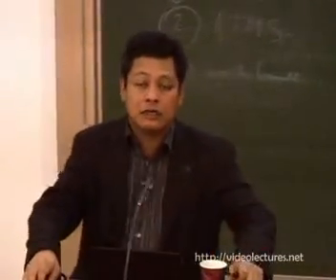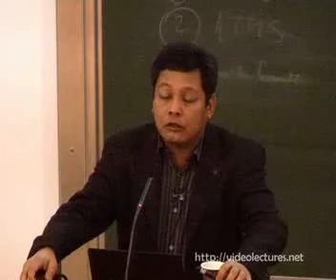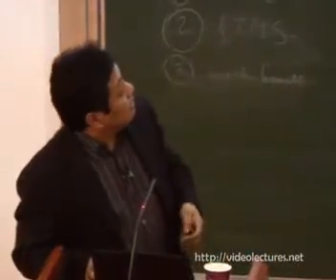Today my talk concerns how we study matter at the atomic level and the single-molecule level, and how we can build devices, for example, but more from the basic science point of view. And this map shows STM manipulations at the current stage.